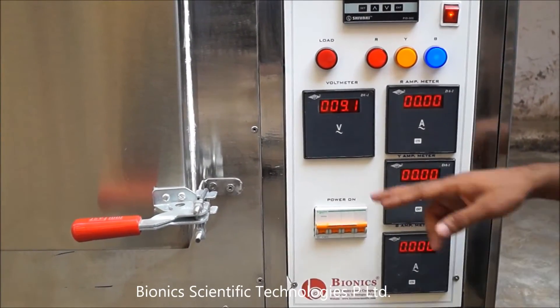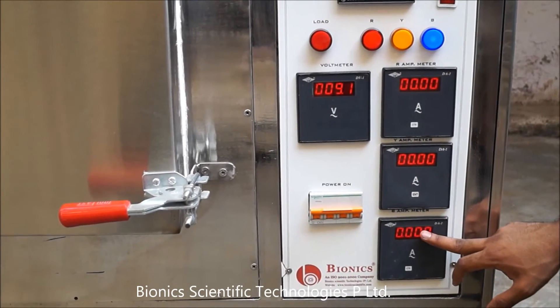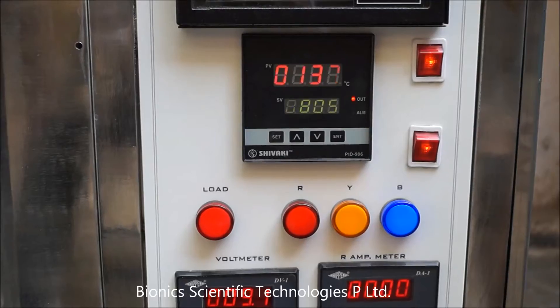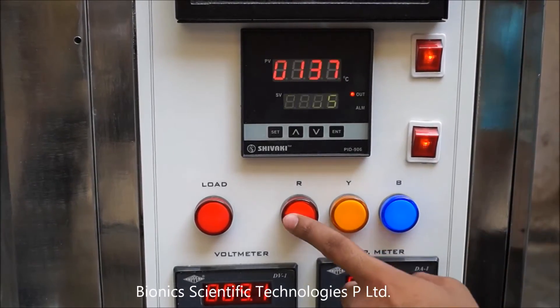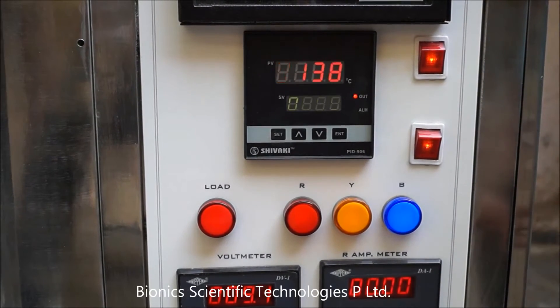This is the voltmeter, and these are the ammeter. As you can see, these three are three-phase indicators, and this machine runs on three-phase power supply.